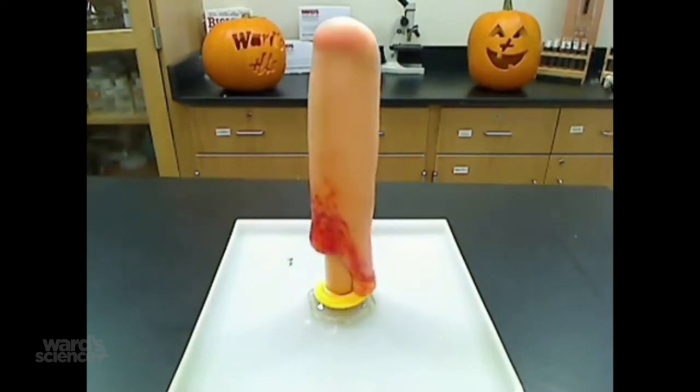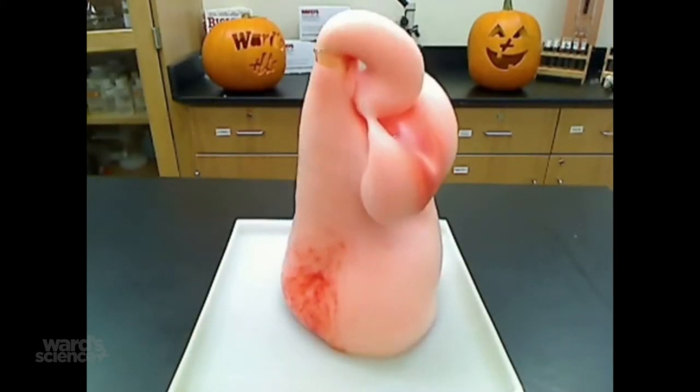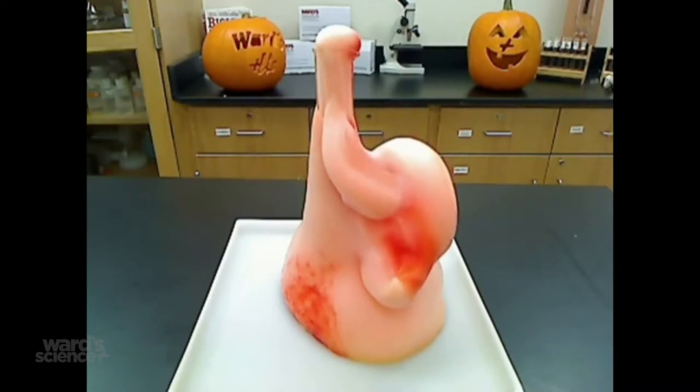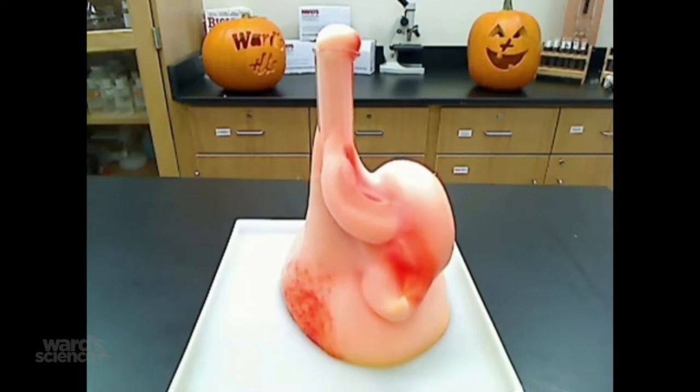As you can see, foam is beginning to form. This shows that the hydrogen peroxide is decomposing into water and oxygen gas, which gets trapped in the foam bubbles. The potassium iodide acts as a catalyst to initiate this reaction.